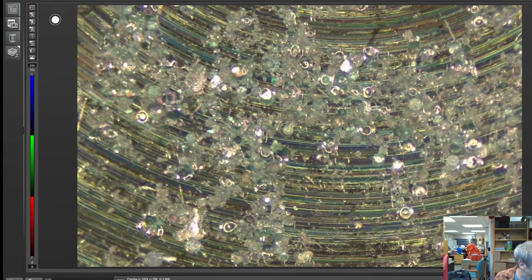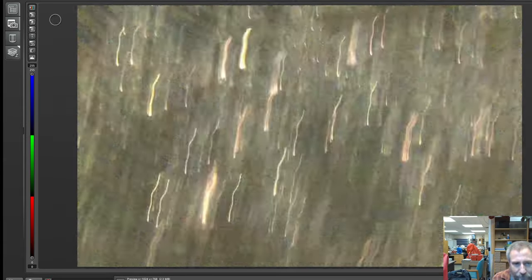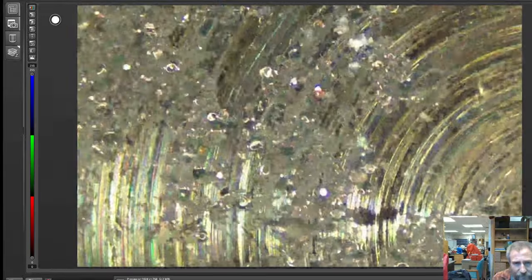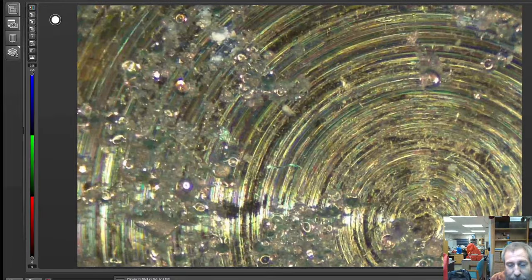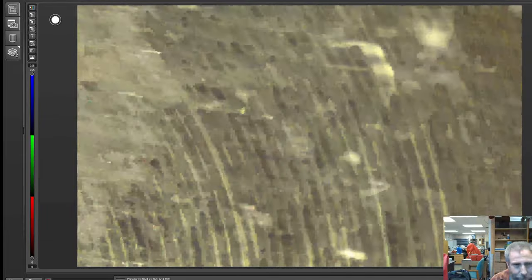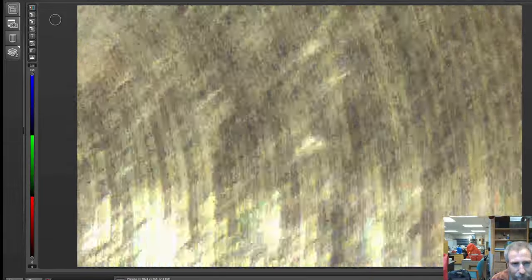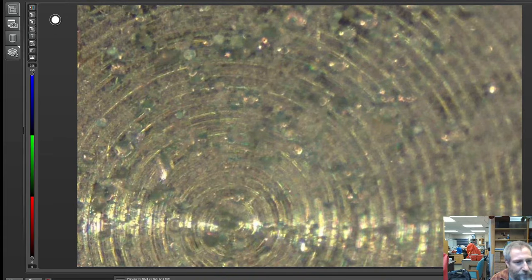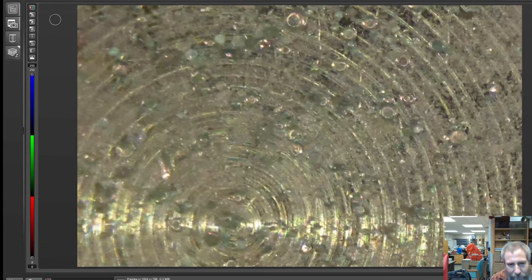And if there was a sample that had some of the copepods or whatever else, we'd definitely be able to see them with the stereomicroscope. The lines that you're seeing, the rings that are on here, are actually from when they milled the aluminum cylinders. They ground down the metal that way, basically. So I think this is what I was asked to do explicitly by, I think it was Studio Cornix, who wanted me to look at what we could see. Could we see the actual samples with the gold coating on them?